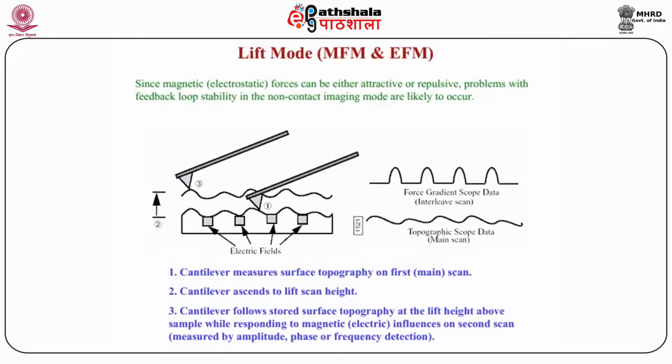This gives the lift mode of MFM and EFM. Since magnetic forces, or electrostatic as we call it, can be either attractive or repulsive, problems with the feedback loop stability in the non-contact imaging mode are likely to occur. This has been shown in the diagram here.